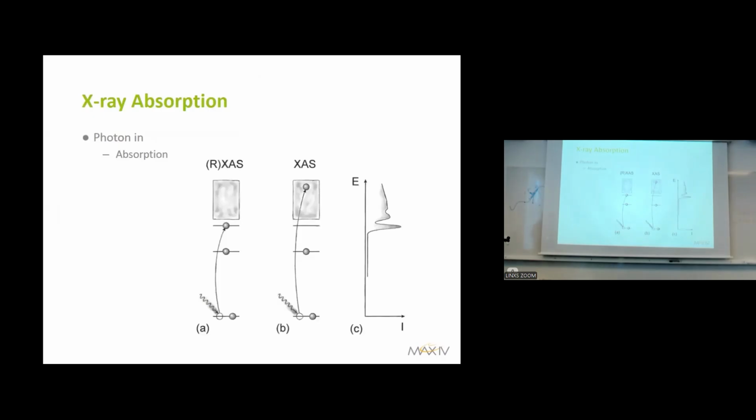So X-ray RIXS starts with absorption, and I think you had a probably extensive talk by Konstantin the other day about X-ray absorption. Absorption is basically you create a core hole by absorbing a photon. You can either shoot with high energy and just kick the electron out to continue. This is then non-resonant, that's what we call it. Or you can fine-tune the incoming photon with a synchrotron and put it into one of the empty states. This then creates the resonant part of the RIXS.